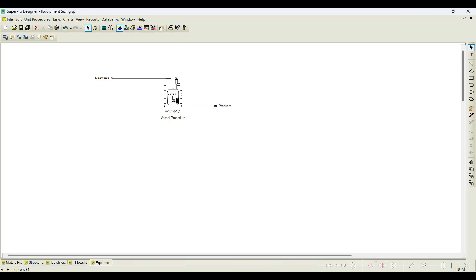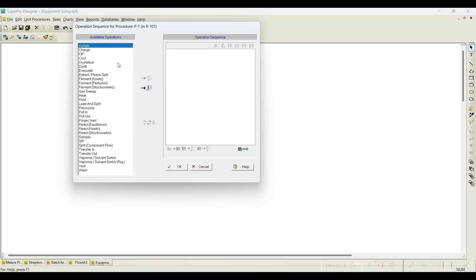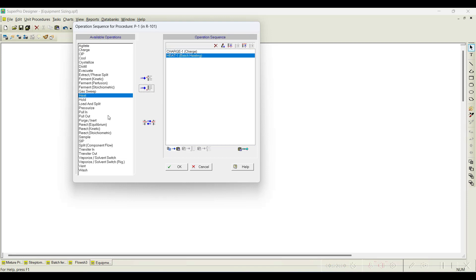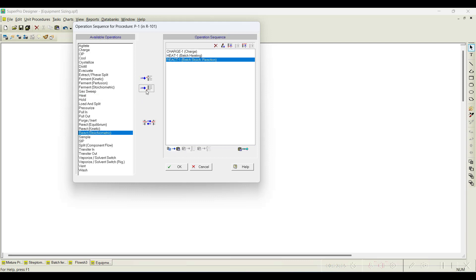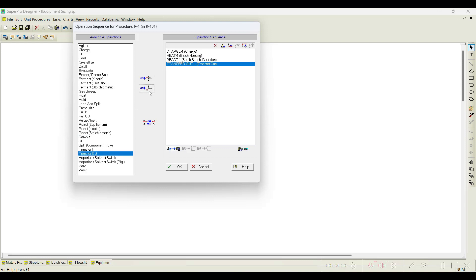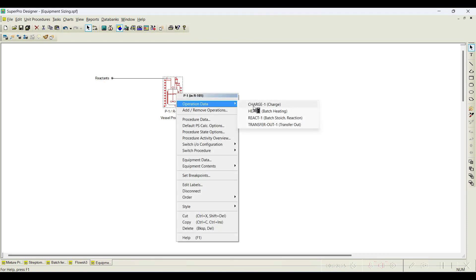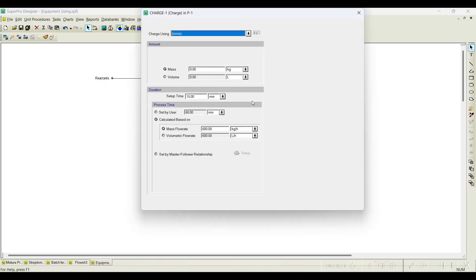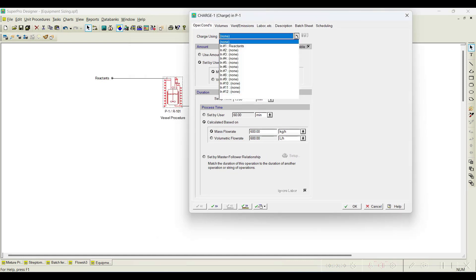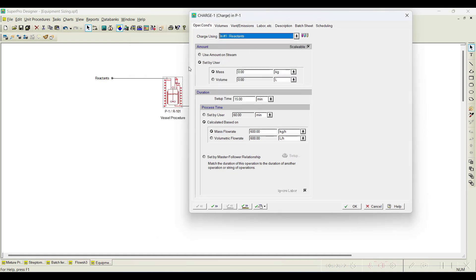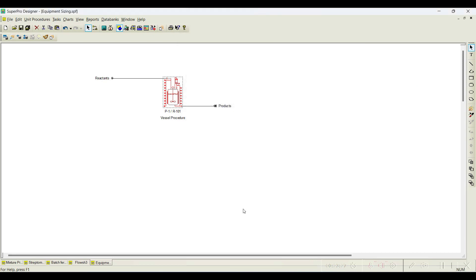Click OK. We need to add batch operations: charge the reactants, heat the reactants, carry out the reaction using stoichiometric mode (since kinetic information is not available), and transfer out the content. For the charge operation, we need to charge the reactants using the user amount set on the stream, with the rest at default values.